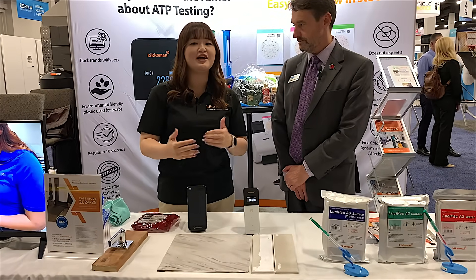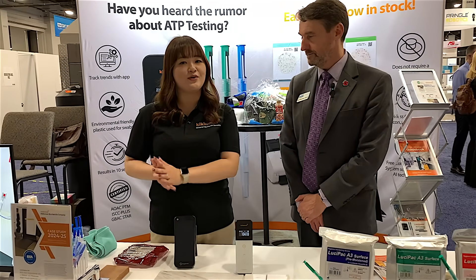For ISSA, they have a standard for our LumiTester Smart and LuciPac swabs, which is 4,000 or below. Of course, there are very hard surfaces that are difficult to clean, which may not achieve the 4,000 target — but that means you can do a re-cleaning and try to bring it to that number. You can also set your own standards more suitable for your own facilities. Start testing — just start measuring before and after. They can show and prove how much they are doing with their cleaning, protect their brands and their employees, and with the app that goes along with it, track all their trends and see how much they've improved.